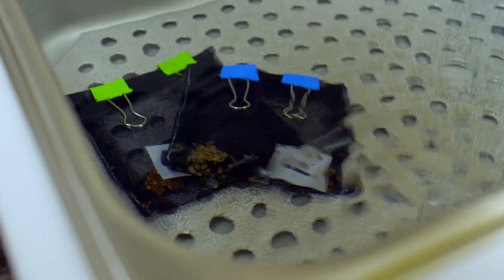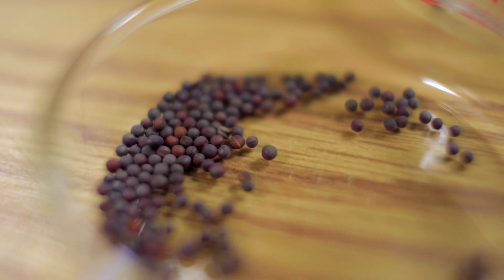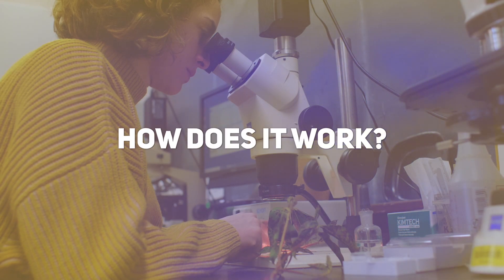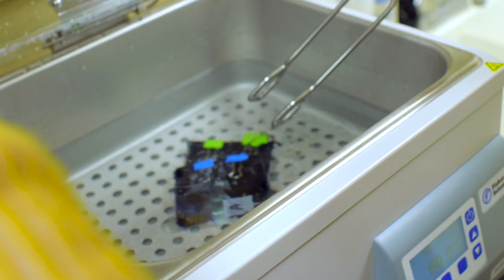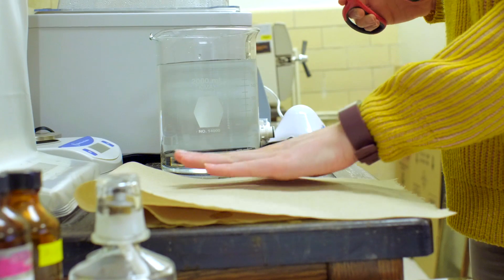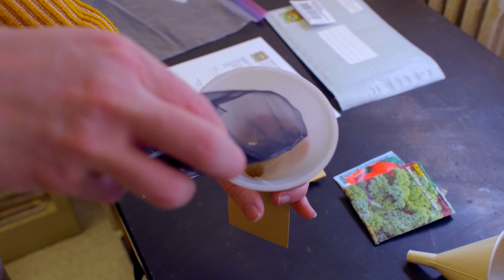By using hot water, we're able to kill pathogens that infest the seed both inside and outside. The process is very simple: we use water baths set at two different temperatures for the seed treatment, dry the seeds thoroughly using a fan-only dryer, and then package the seeds up and ship them back to you.